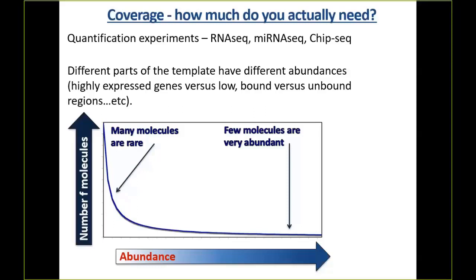It's a bag of hemoglobin that people call a cell. So it was looking at one cell, and in this case, most of its RNA was actually beta globin, and trying to pull up that region in the genome to look at the reads crashed the computer. And this was a reasonably powerful computer. I just watched the memory fill up and fill up and fill up, and the computer eventually slowed down and crashed.